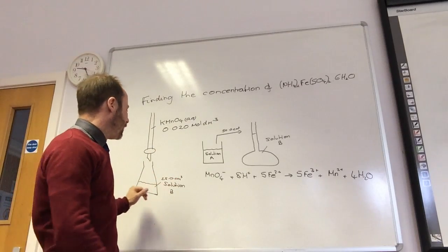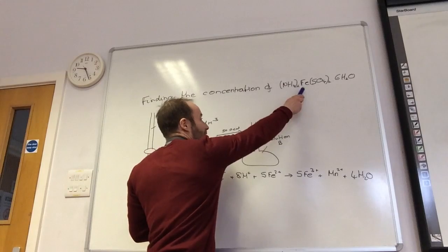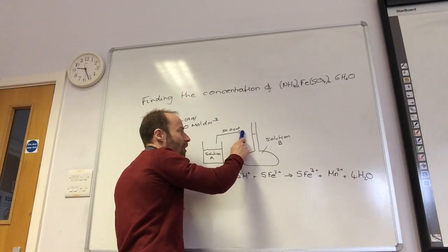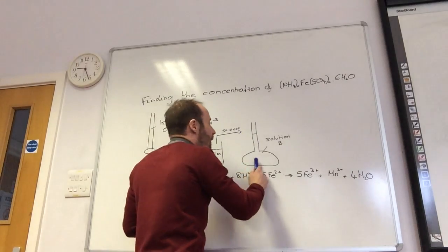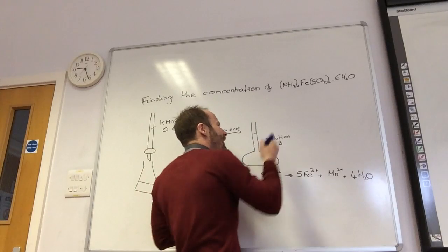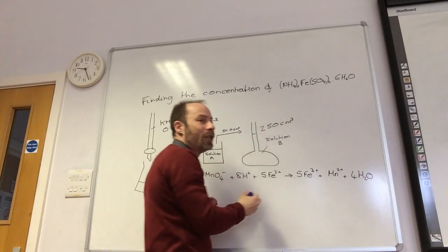I'm going to start with solution A. That is solution A. I'm going to take 50 centimetres cubed of solution A and dilute it down to make solution B. It's supposed to be a volumetric flask, so that's going to have 250 centimetres cubed.